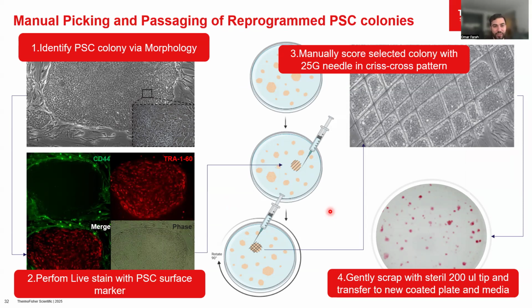That's a great question. So ideally, what you want to do is create clones, like separate clones. So if you've seen that two colonies are merging, I would tend to pick colonies that are more on their own and further away from each other. But if that is not an option, and there are two colonies merging, and you see one of them is potentially a little bit bigger or looks slightly better than the other one morphologically, you can go ahead and scrape a clear border around the cells that you want to pick, right?